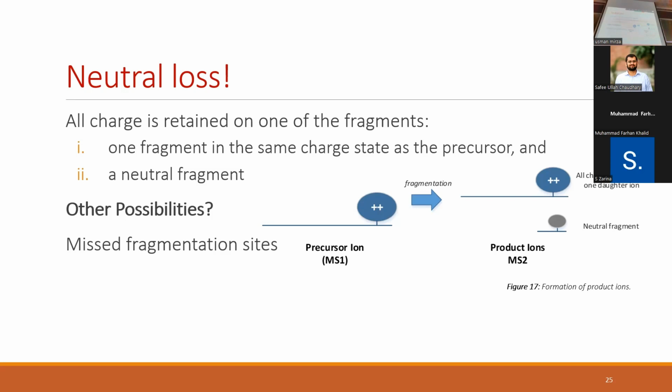Sorry. So let's say precursor ion MS1 is available to you. Yes. The other one is missing. This is also available. That's also available. Yes. Okay. If both are available. Yes. So what was missing then? Second fragment ion. Second fragment ion. Lost.